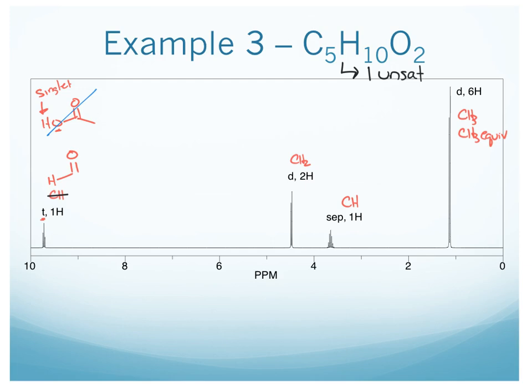So there's one other oxygen in the structure we need to use. I'm also just going to make a couple of notes and say that this CH2 and this CH, that's in the electronegative region. That means there's likely some electronegative atom connected to the carbons. Okay, with all of this in mind, let's try to connect some things together.